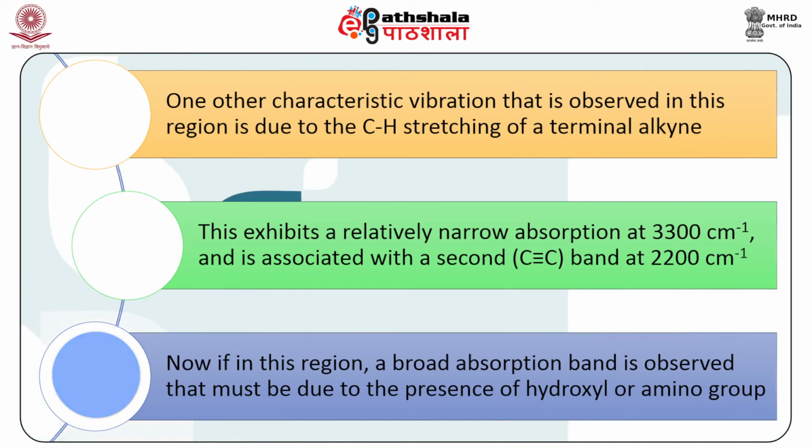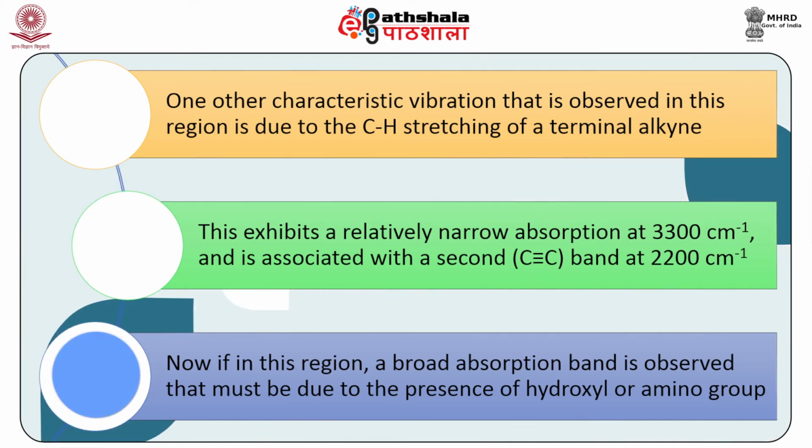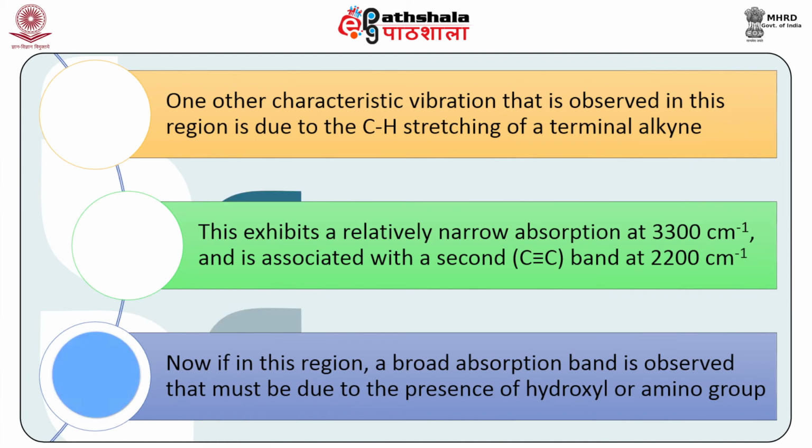Now, if in this region a broad absorption band is observed, that must be due to the presence of a hydroxyl or an amino group.